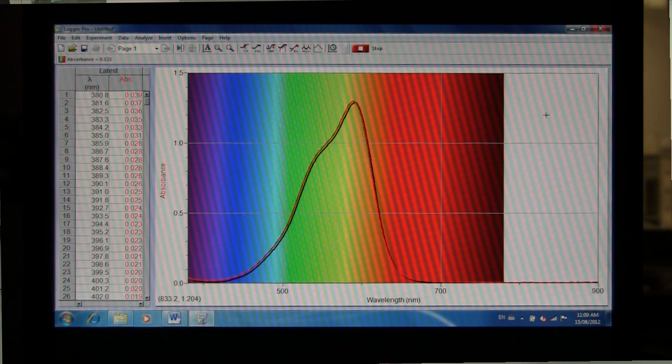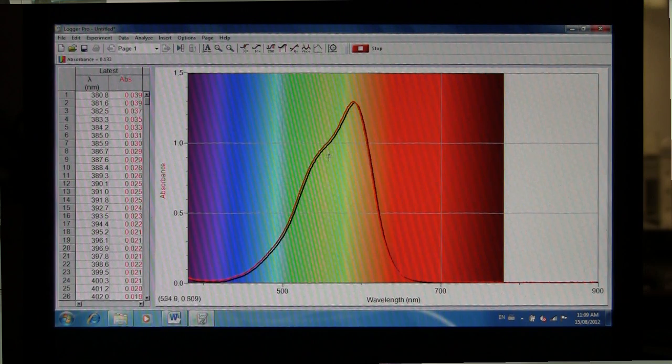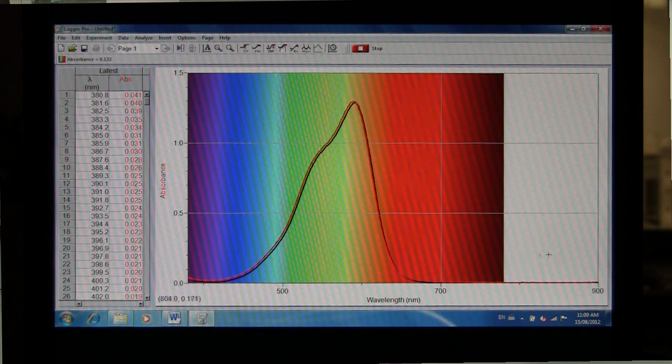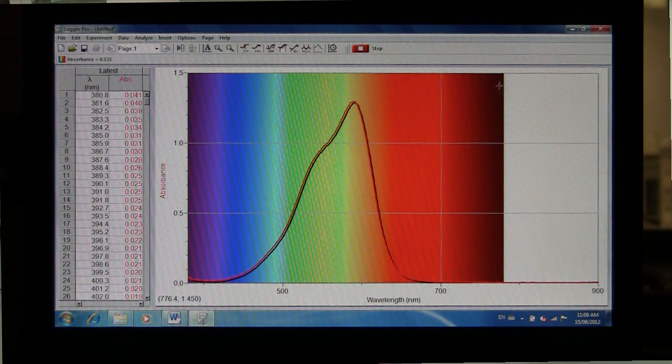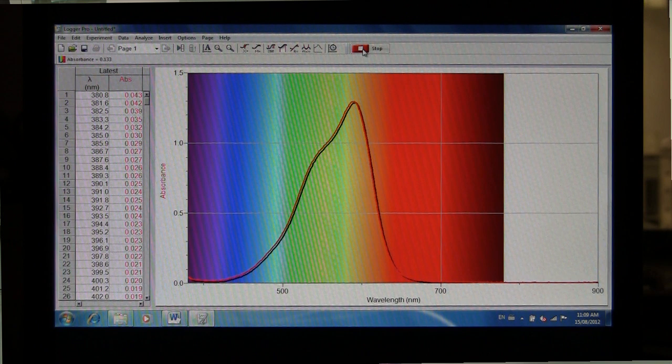After a few seconds, you should see a spectrum pop up. And once you've obtained this, you can then click Stop.